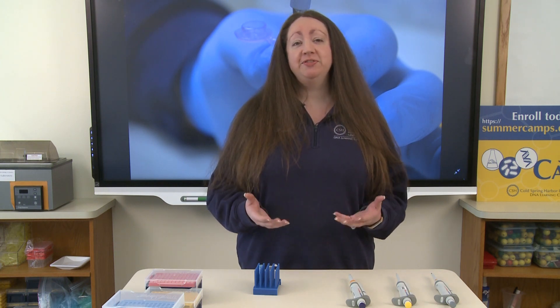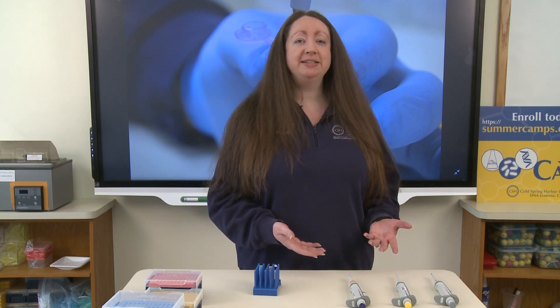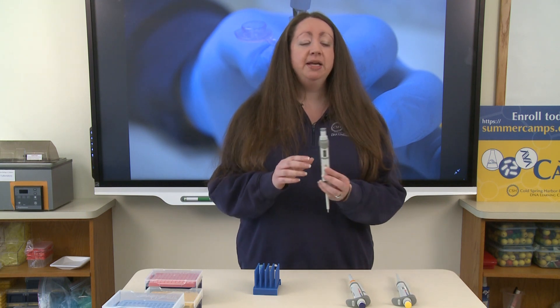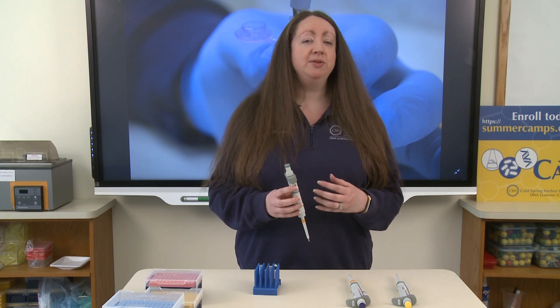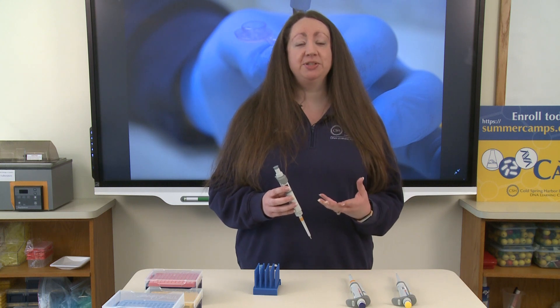We have to use specific tools to be able to do micropipetting. Those are called micropipettes. There are different sized micropipettes to measure different sized volumes of liquid. We use three specific micropipettes in this lab. The ones with the gray cap measure the smallest volumes of liquid — from about half a microliter up to 10 microliters.